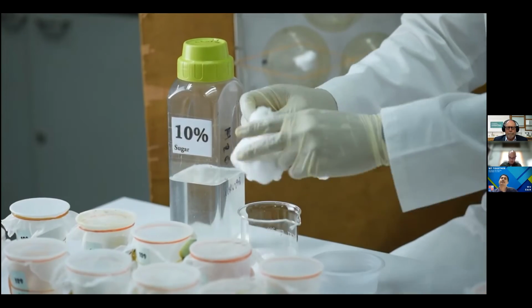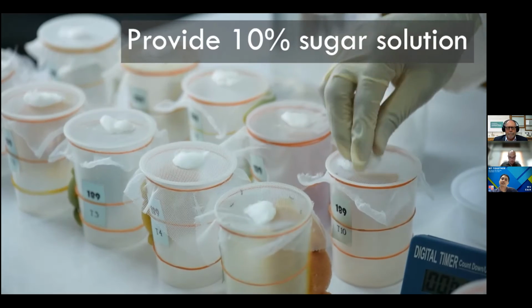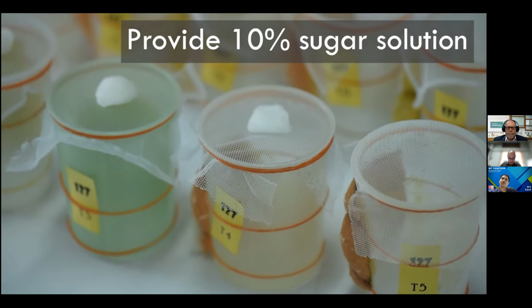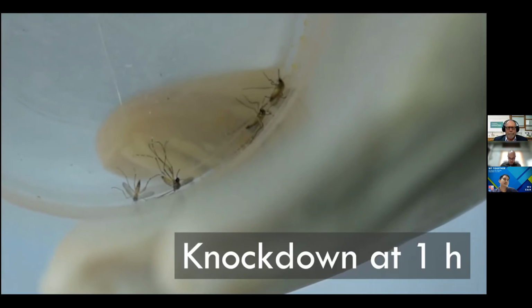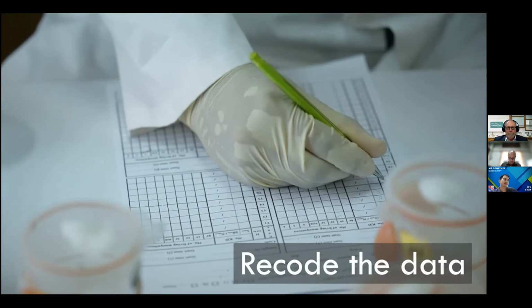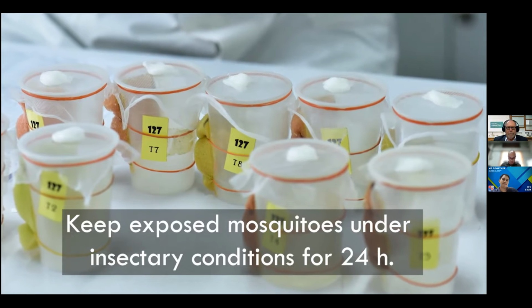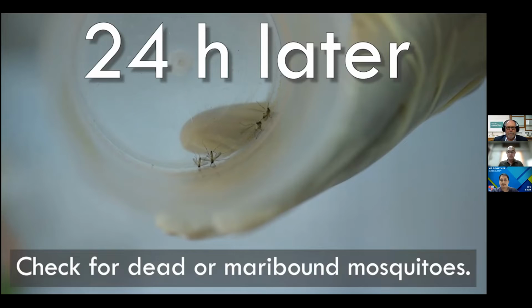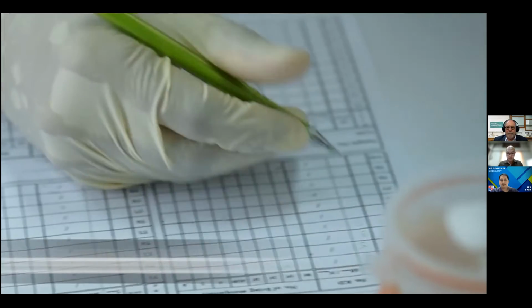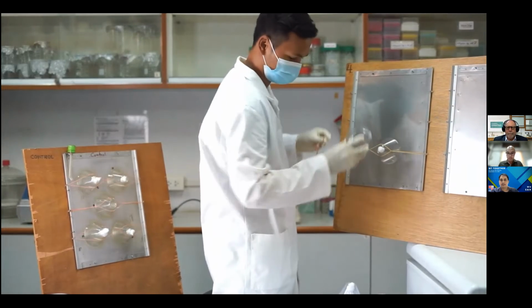Place a wad of cotton wool soaked with 10% sugar solution on top of each cup for the mosquitoes to replenish energy. 1 hour later, record the number of knockdown mosquitoes in each cup into a pre-prepared data sheet. Then place the holding cups in an area free from any predators, such as ants inside the insectary. 24 hours later, record the dead or moribund mosquitoes. Finally, clean all the equipment with an appropriate detergent or solvent.